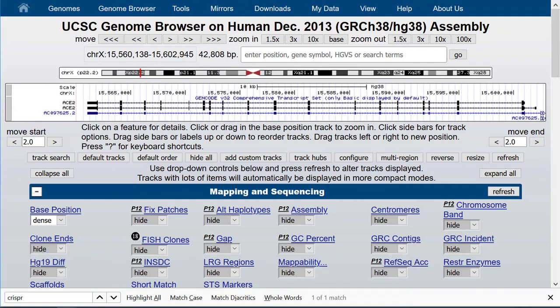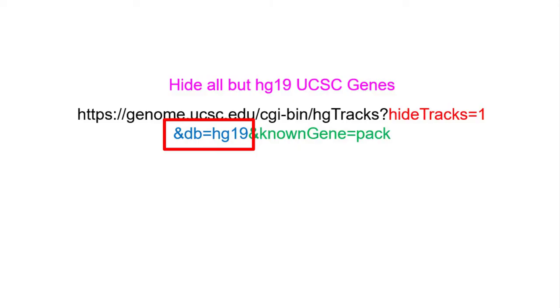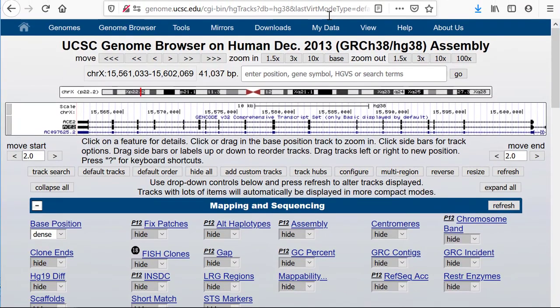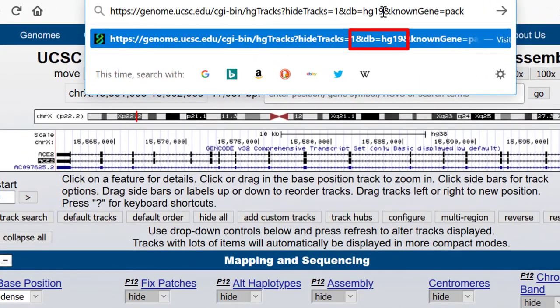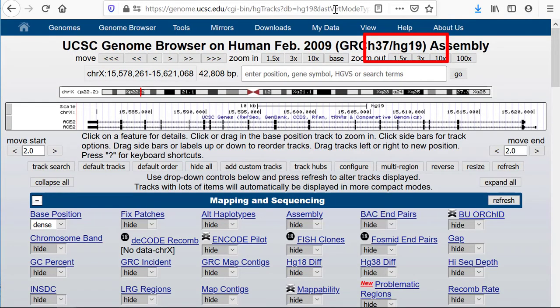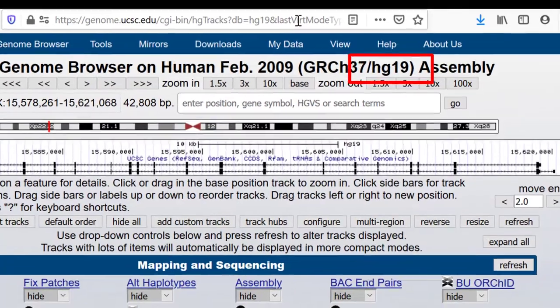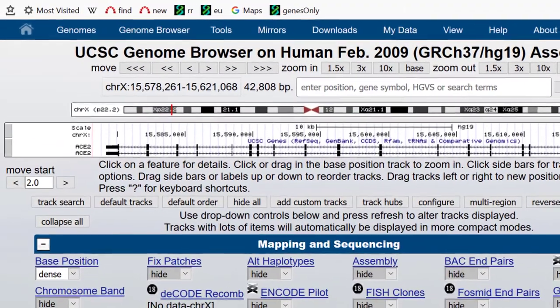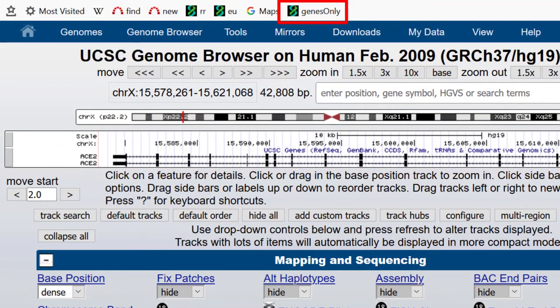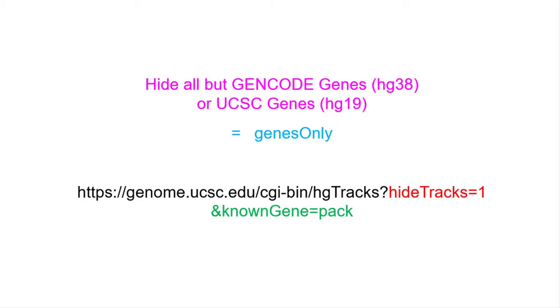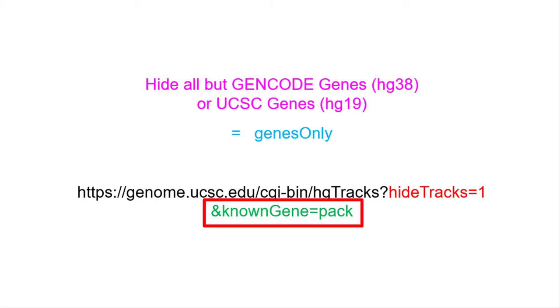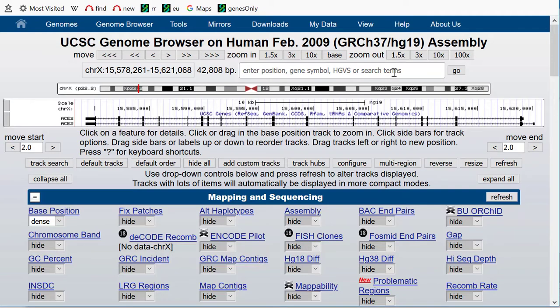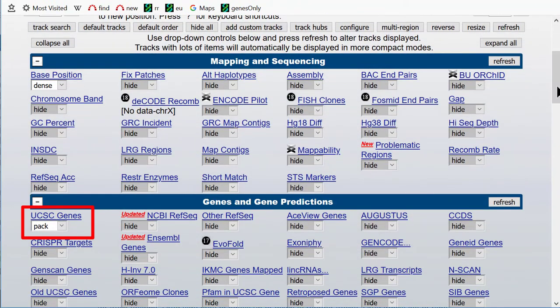Table names are often several words strung together using intercapping, more commonly called camel case, where everything is lower case except the first letter of internal words. We can make the same URL for hg19 — on hg19, the knownGene table opens the UCSC genes track. Here we have substituted hg19 in where hg38 was before.